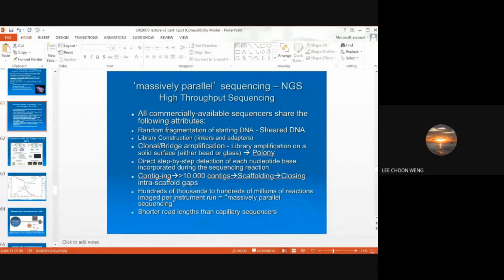So in the last lecture we were talking about the use of very traditional methods, colony and gel electrophoresis based methods, of estimating the microbial diversity in environmental samples. Okay. But those methods are really no longer in use unless you are looking for very special occasions.